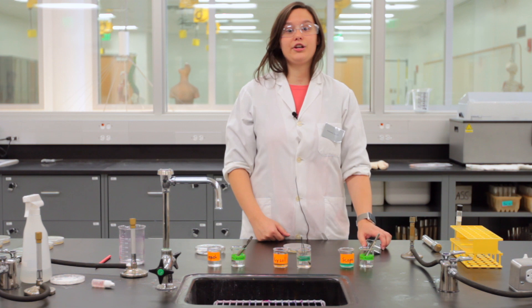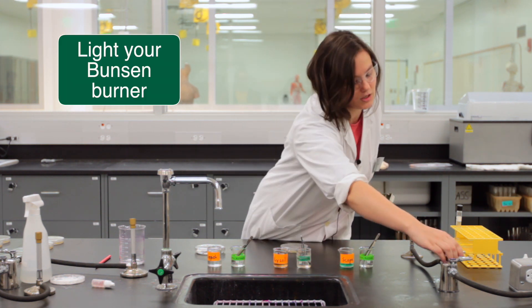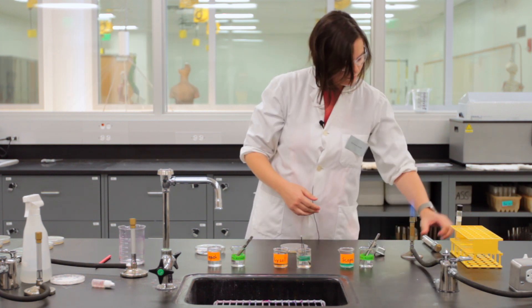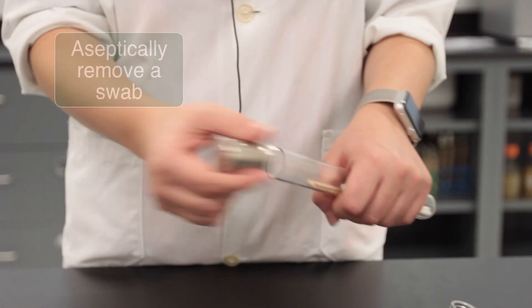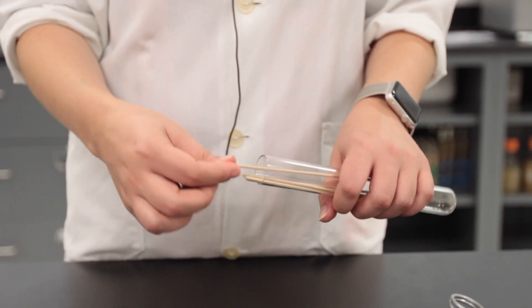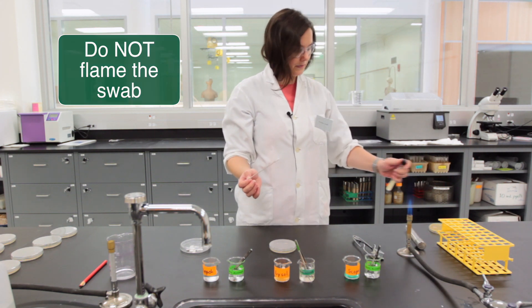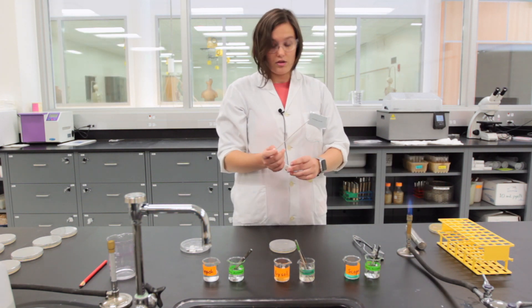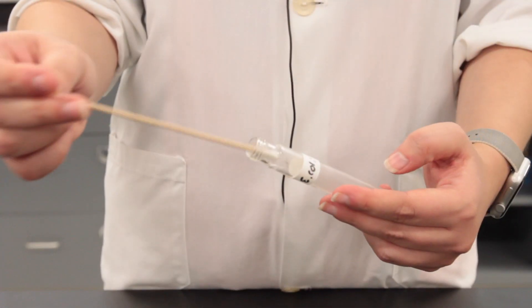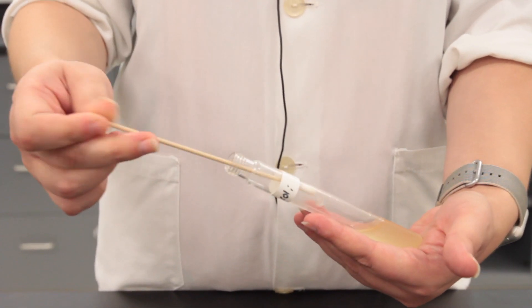To begin, we have to streak a confluent lawn of bacteria on our nutrient agar plate. Get your Bunsen burner ready and use a sterile swab to collect the bacteria from the culture tube. Do not flame this swab — it is already sterile and it will catch on fire if you flame it. Aseptically collect enough of the broth on your sterile swab, getting a little bit of the broth out.